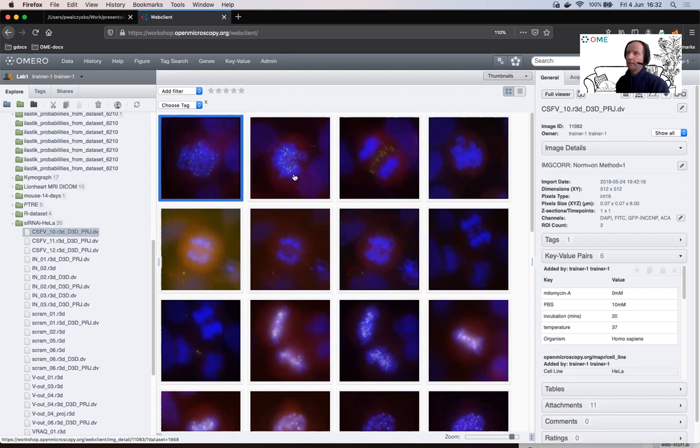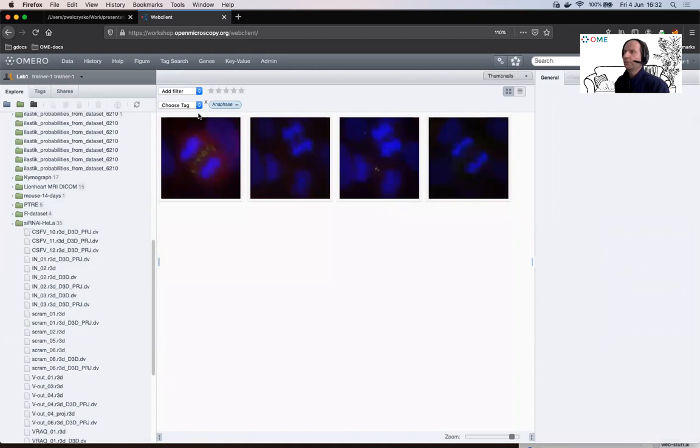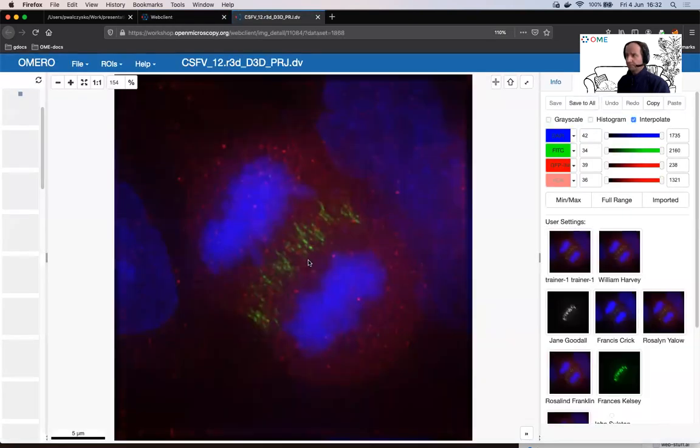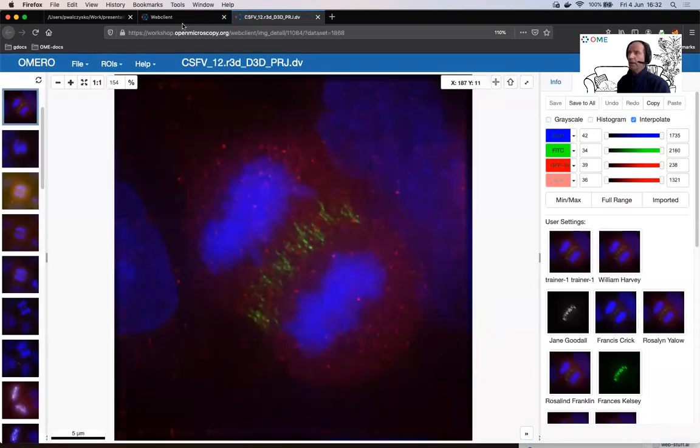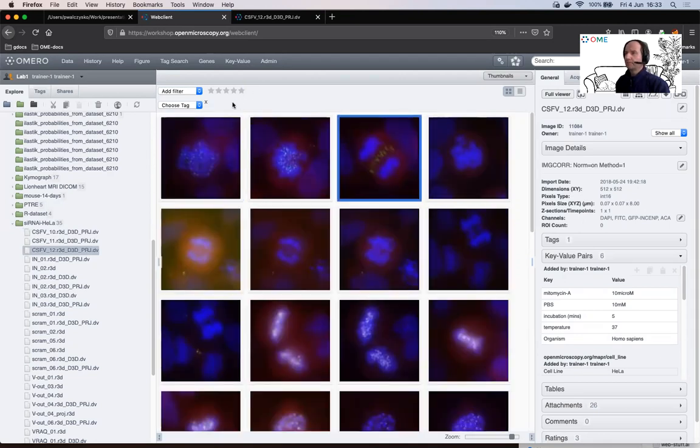And then we will explore the capabilities of OMERO with handling varying imaging formats, data management using annotations, how to use these annotations then to do some filtering, and how to use search in OMERO.